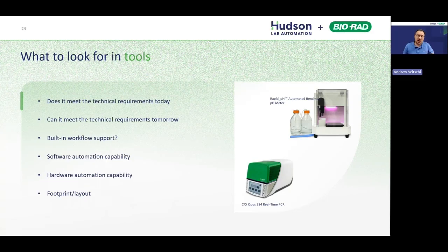that allow the workflow automation to happen. And then from a hardware support standpoint, this is a little bit more complicated than just saying, can you pick up a plate, right? So the diversity of how you pick up a plate, like does it support a variety of labware grippers so you're not pigeonholed into one vendor? But also, where is that plate presented, right?